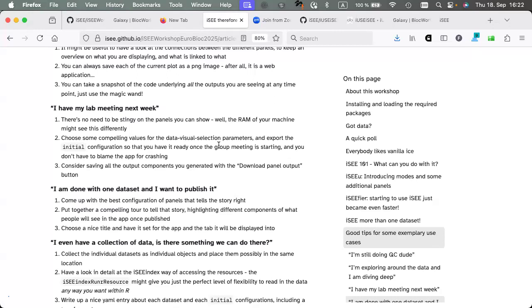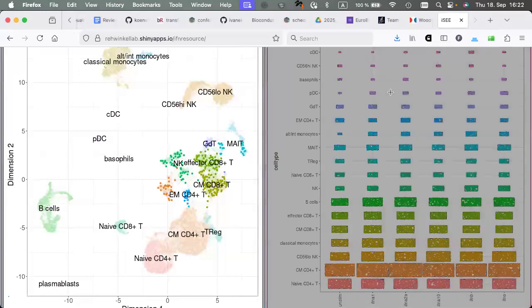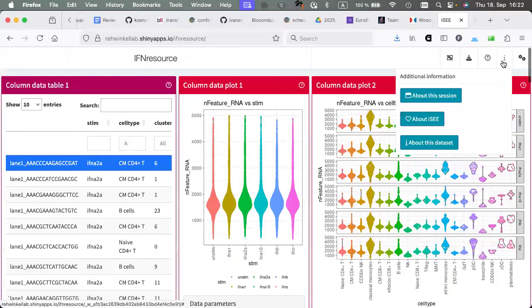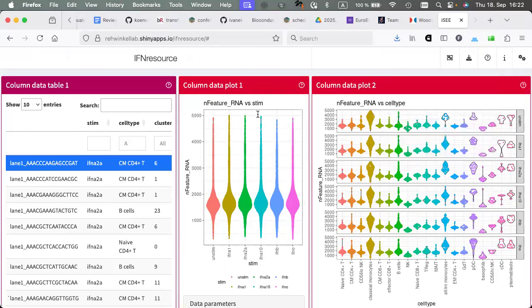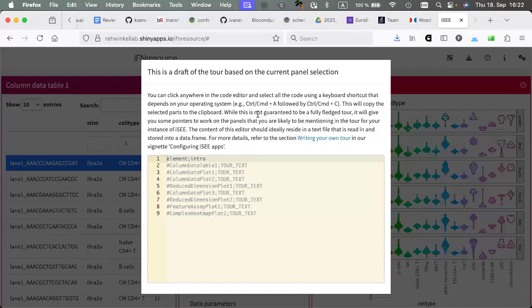And actually, what I can show you is that we have this kind of tour suggester. To know a little bit more of the tour, you need to anchor something. So I'm giving you, based on the panels that you have open, the name of the panel here, and then you can start expanding on the tour. It might be a little bit more complex than that.